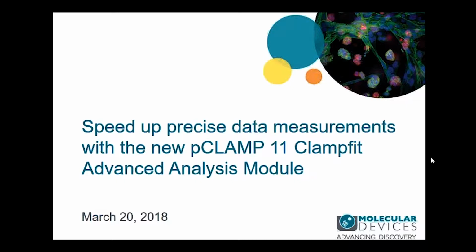I'm very excited to introduce my colleague, Dr. Jeffrey Tang from Molecular Devices. Dr. Tang will be highlighting the newly introduced Clampfit Advanced Analysis module in pCLAMP 11 and how you can use it to make your data analysis process faster, easier, and more precise.